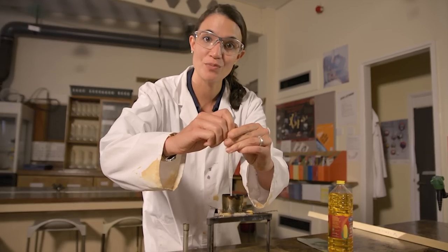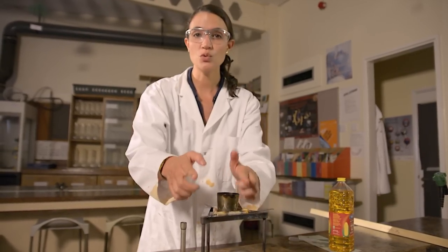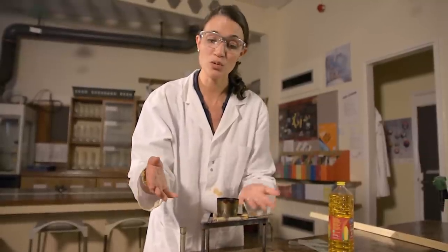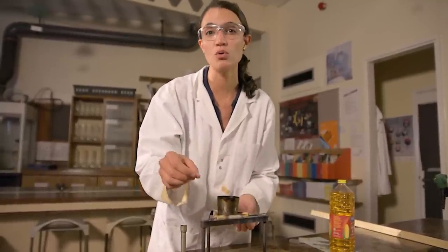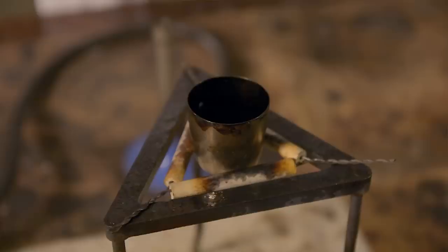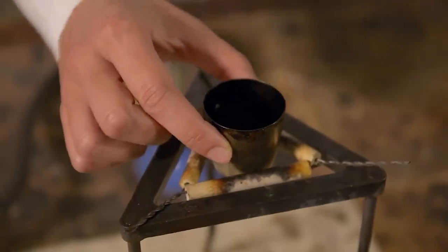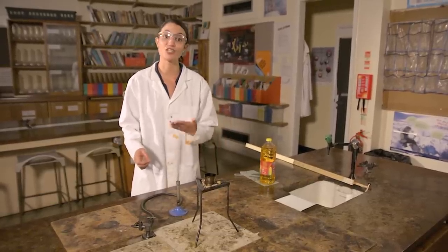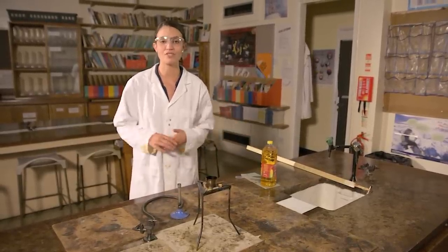The choice of crucible is really important. You want to find one with tall straight sides because we don't want hot fat spitting everywhere. We're also using a nickel crucible because porcelain can crack under these conditions. You need to make sure the crucible is well wedged into that clay triangle. You need to surround the apparatus with safety screens and ensure that students are set back a safe distance.